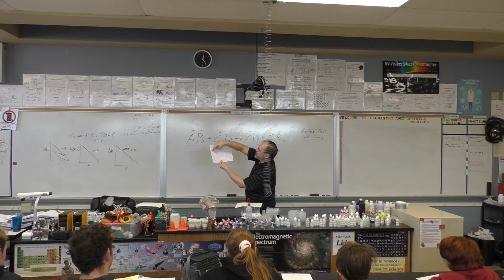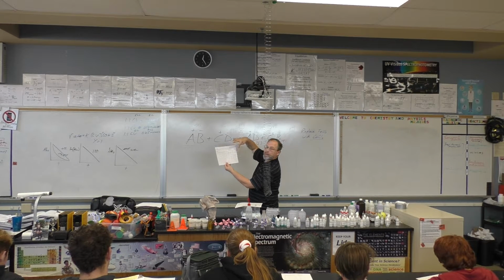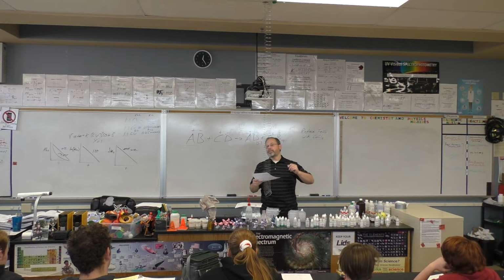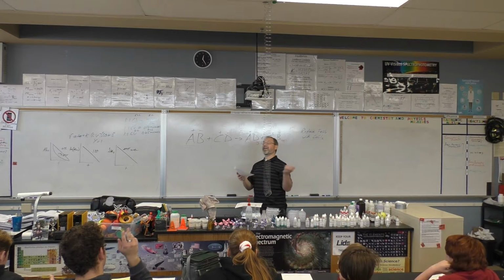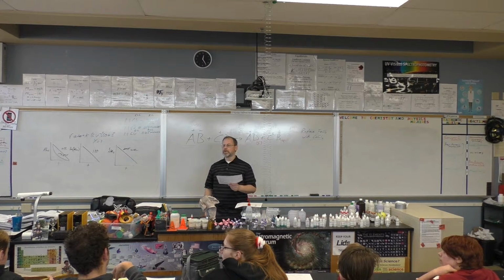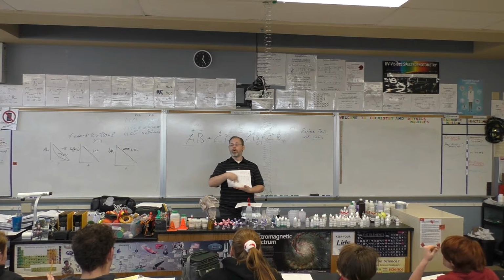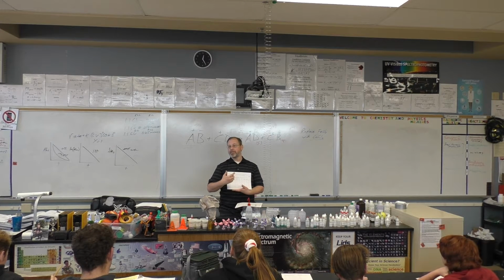So you're going to do these combinations. All of these are going to be done. So your first combination might be sodium phosphate with silver nitrate. If you go sodium phosphate, drip, drip, drip, silver nitrate, drip, drip, drip, and then it forms a precipitate, you would write yes. Yay. Or Y. Does it matter which one you put in first? It doesn't. And you can do them in any order. You're going to do the whole combination. The reason that half the table is X'd out is because that would just repeat it. You don't need to. So you're like, I got calcium chloride, and I'm going to react it with sodium sulfate. Did it make a precipitate? Yes or no? Make sense?